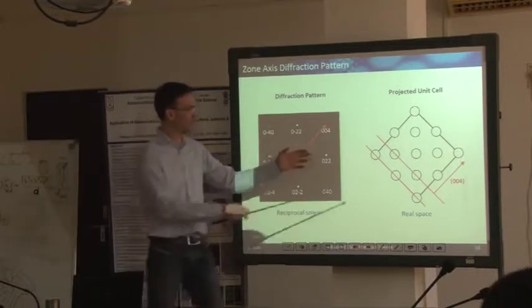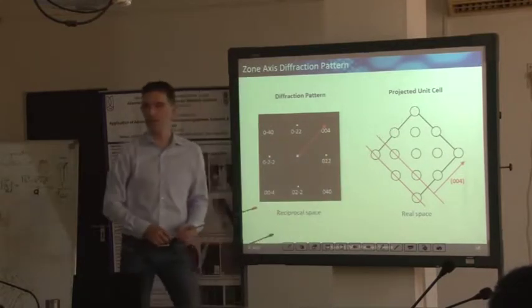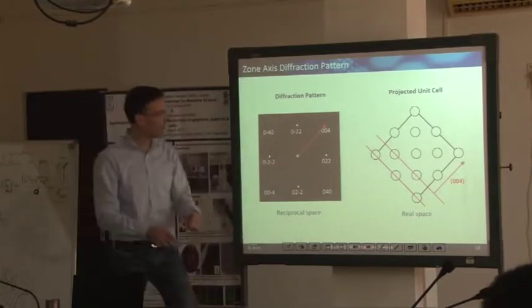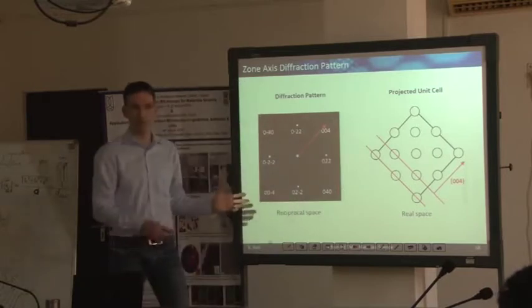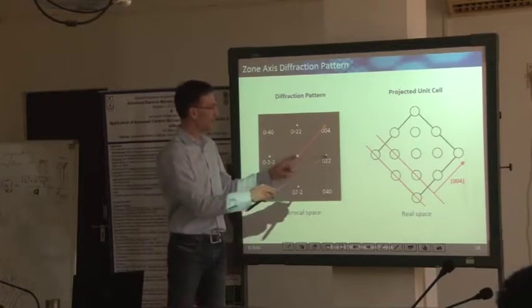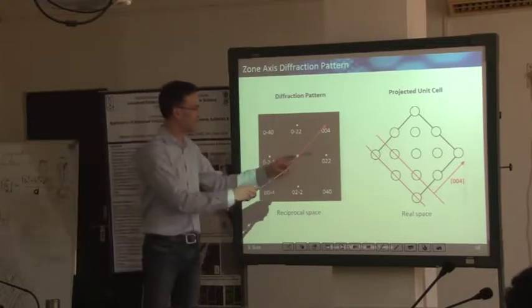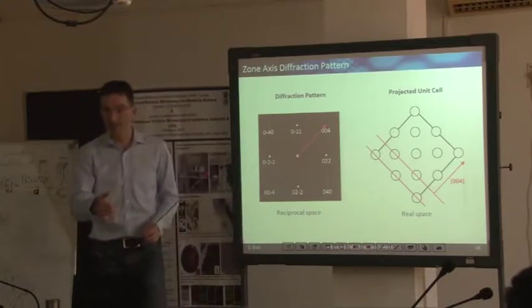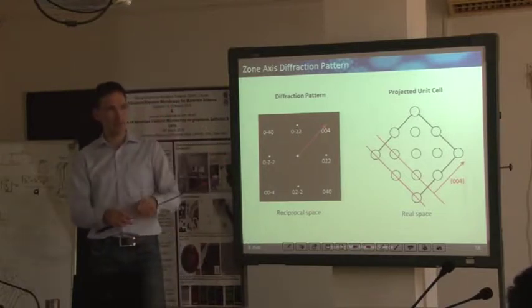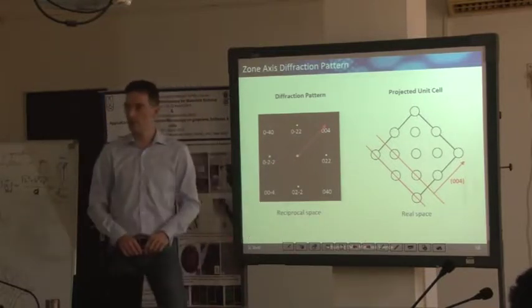And if you take this direction, let's say along one of these edges of the crystal, and then tilt to illuminate the crystal along the diagonal, for instance, the diffraction pattern would look different, because you have to keep in mind that these G vectors have to be perpendicular to our incoming vector. If the incoming k vector is already 111, so that we illuminate along the diagonal, then there could hardly be a 004 reflection. Why?